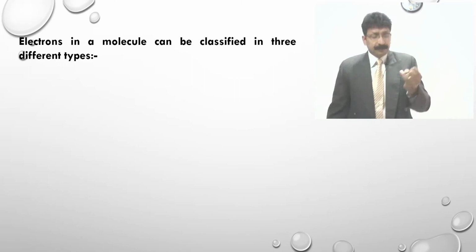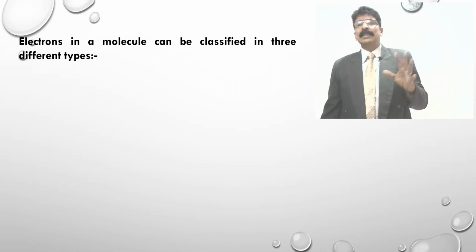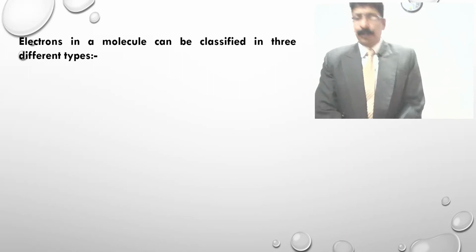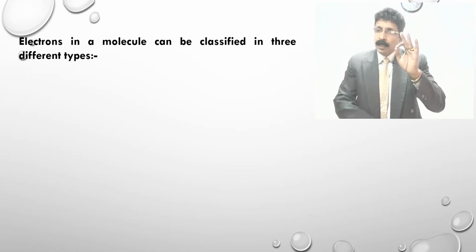So electronic configuration, what happens? It is very important to know, because we know about bonding, we know about the electronic configuration of various atoms and various substituents which are present. So certain theoretical terms you have to know in this UV spectroscopy, which will be helpful for you to write your exam, and in the future you may go for higher studies and research. It will be helpful, this basic knowledge which I am giving only to degree students. I am not going very high, whatever I know, I am just giving an explanation.